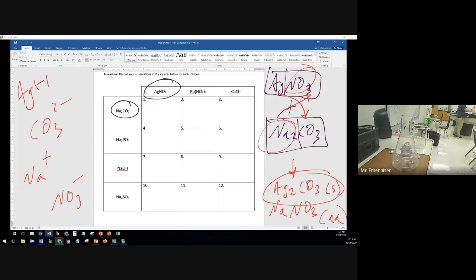Now I'm making some water so that I can spray it a little bit. I'm just getting some tap water for this. Let's see. So the liquid will go through, the solid will remain. This is kind of thick filter paper. Why is the liquid not going through? Maybe it needs to sit. That's water, so I don't want to mix that up with anything else. Come on, Mr. Water, go through the filter paper. Maybe this filter paper is too thick. It'll probably just take time, so that'll evaporate.